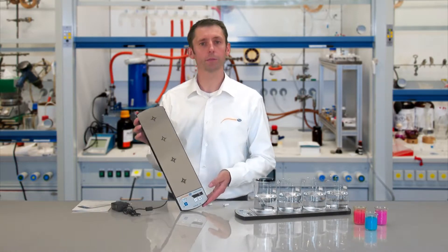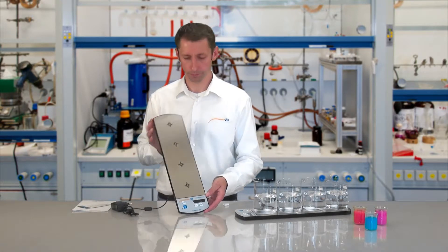In the delivery we have the Magnet Stirrer, four stirring rods in a length of 25 mm which are PTFE covered, as well as the user manual.